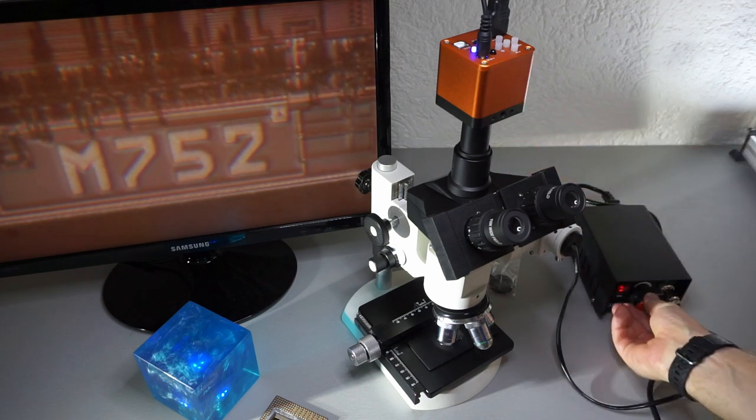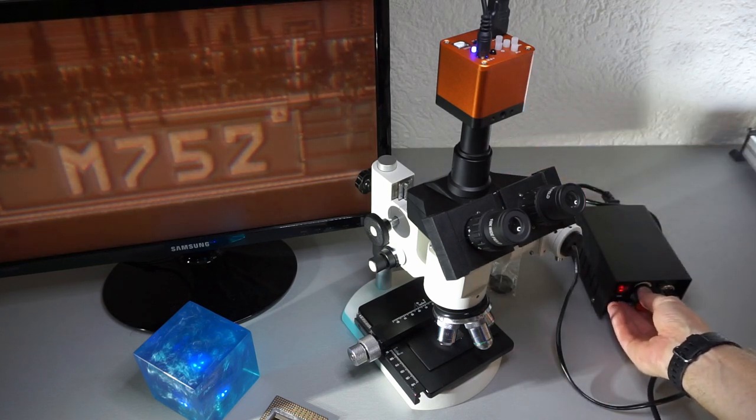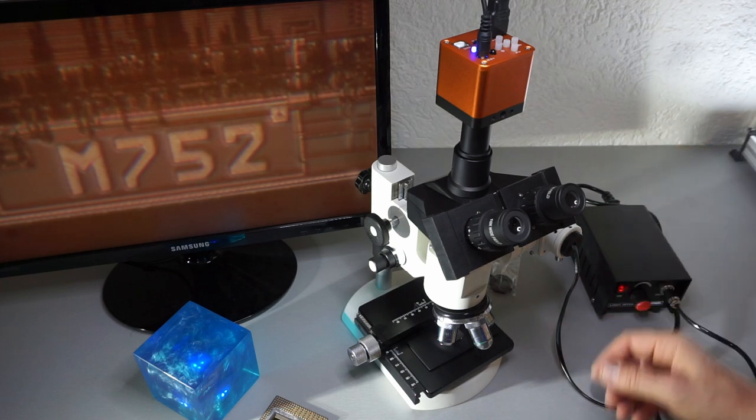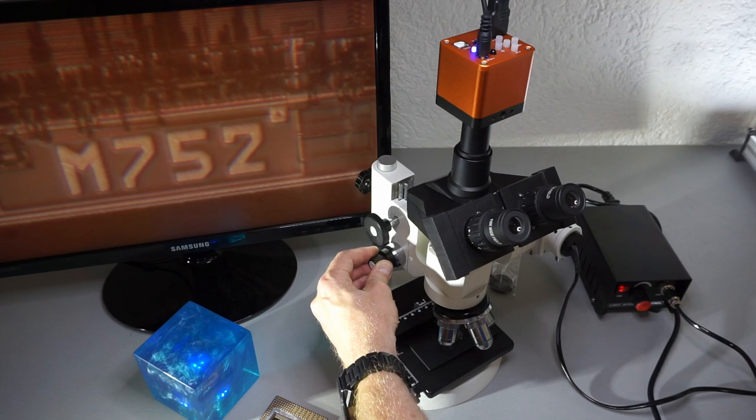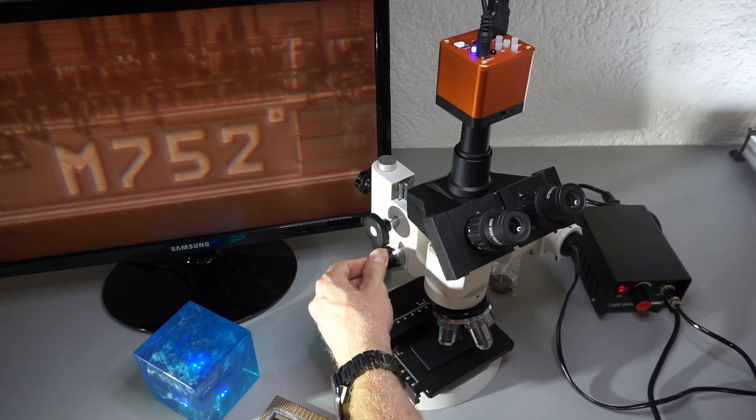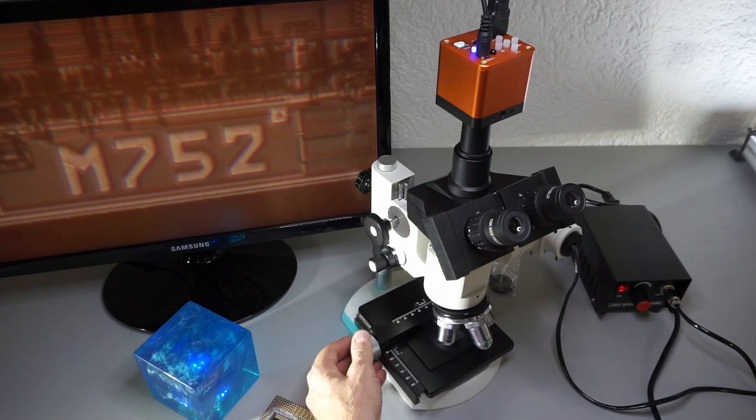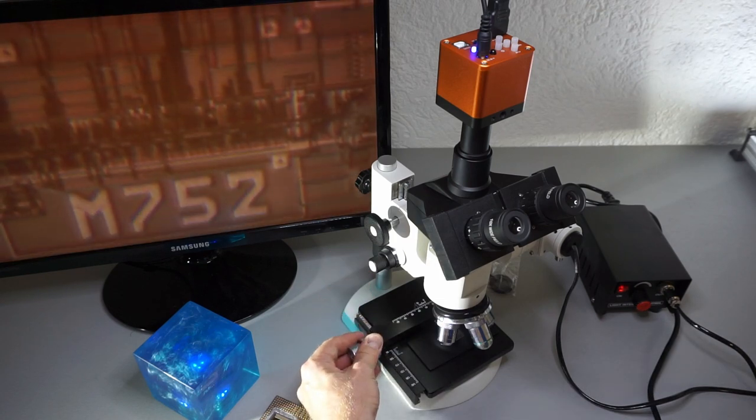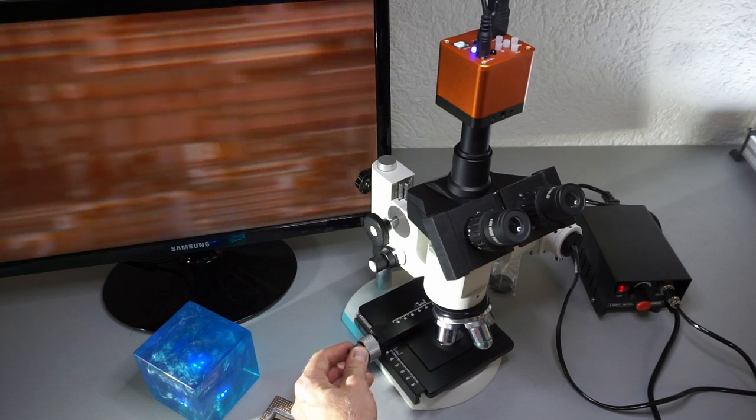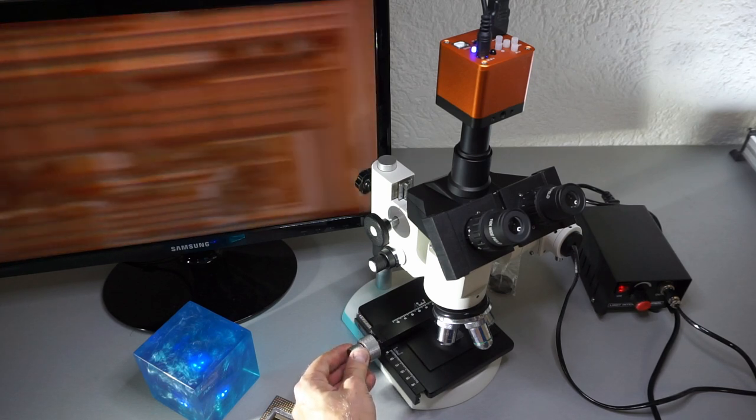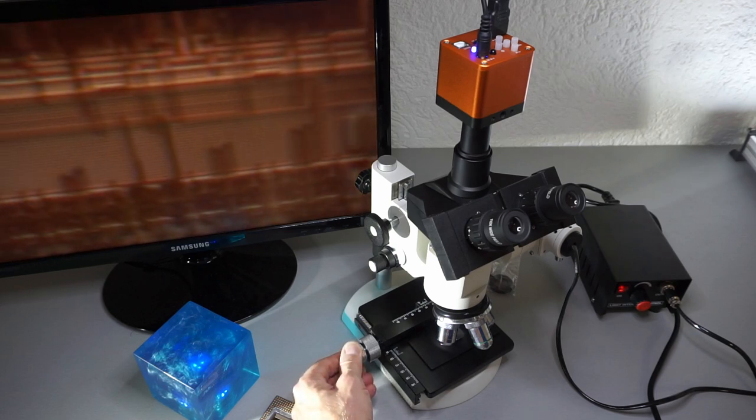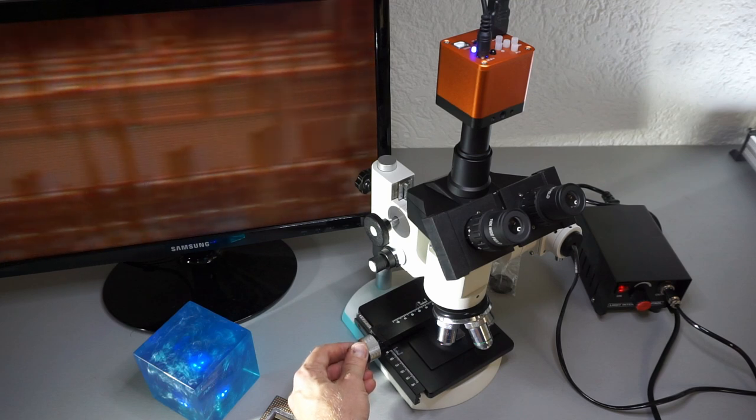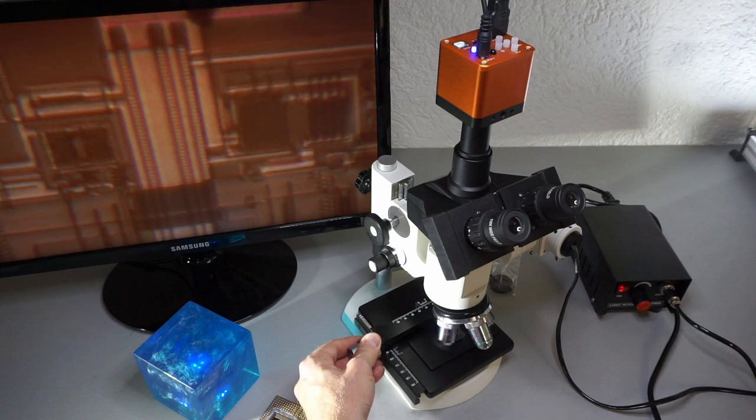And this chip is M752. It looks really astonishing. Using a little bit of cursor to screen around, and the stage looks really nice. Very smooth, I like the stage. The stage is stable, the stage is large, it can really cover large chips.